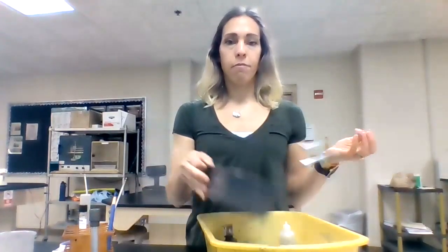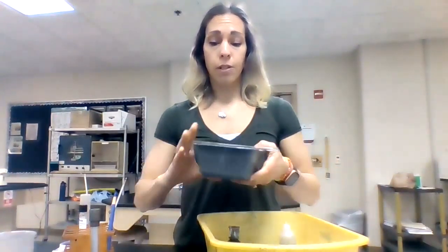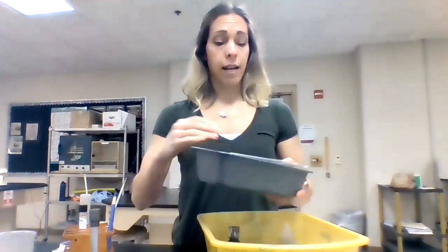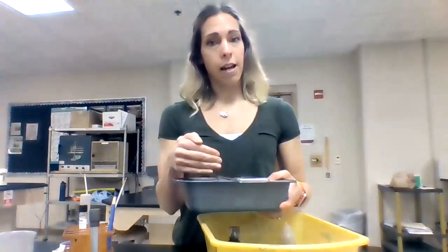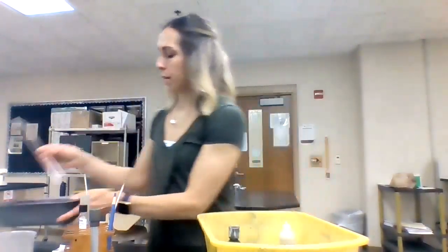Then you're going to have some type of bread pan — I call this a slide holder. What I did was I heated glass and I bent it. So when we are doing our slides, you can rest the slide holder across the bread pan so that when we are lining them up to put dye on them, they don't fall in and the dye can fall straight into the bread pan. So you have some version of a glass slide holder and some type of bread pan.